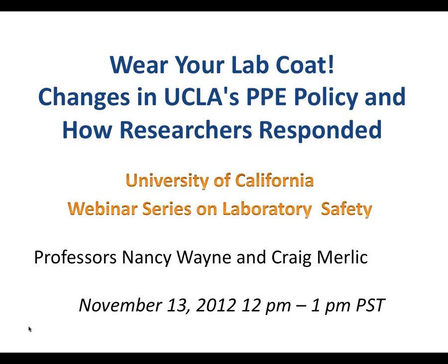...separation than for working with a small amount of hydrochloric acid. So right now it's being left up to the PI to make that assessment, and I think that is the correct way to go. One rule we use here at UCLA is called the LA Times test, and that means that if you would want to have your protocol splashed over the headlines of the Los Angeles Times, most people probably wouldn't want that. So if you're going to pass the Times test, they're not going to write a story about you, then it's probably okay.